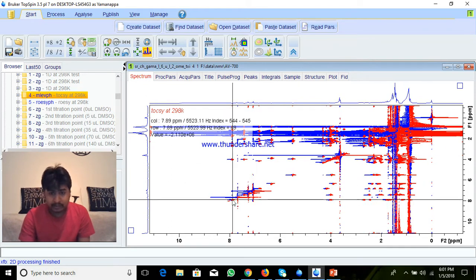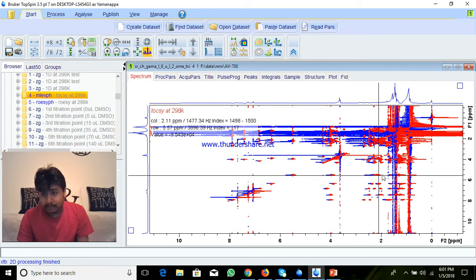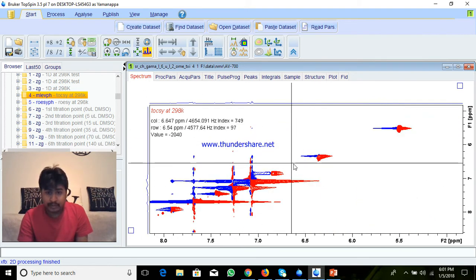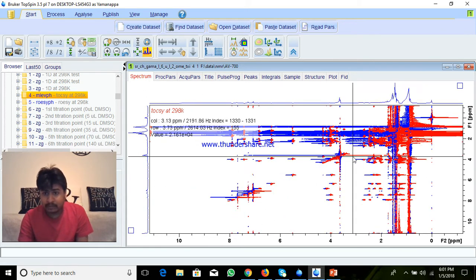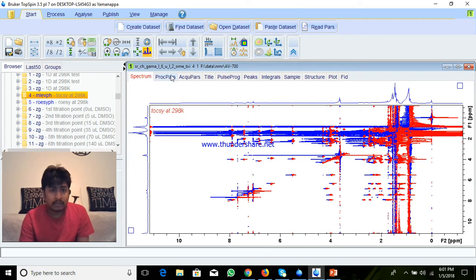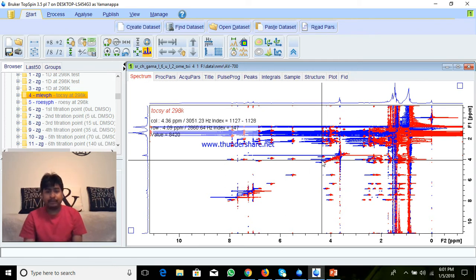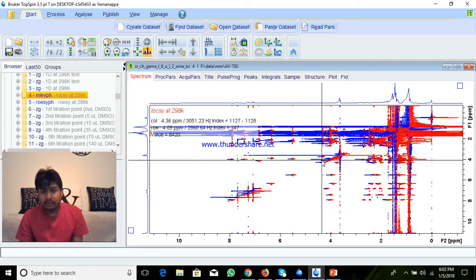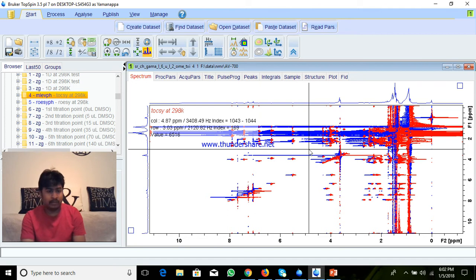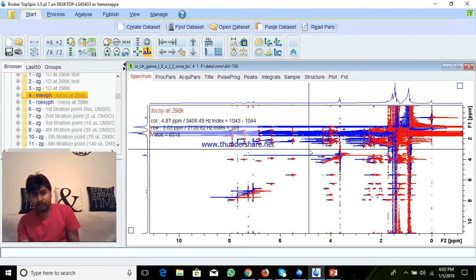Another thing is when you open the spectra, the phase is too bad because it is out of phase. So we have to do phase correction and baseline corrections. In this video, I am going to explain how to do phase correction, baseline correction, peak picking, integration, and how to extract the image as a PDF and image, and how to use this for publications.